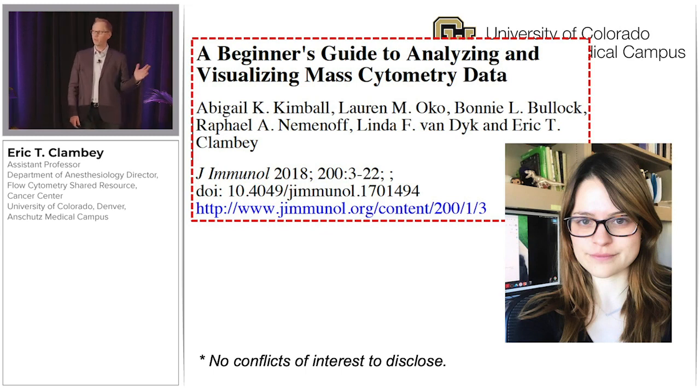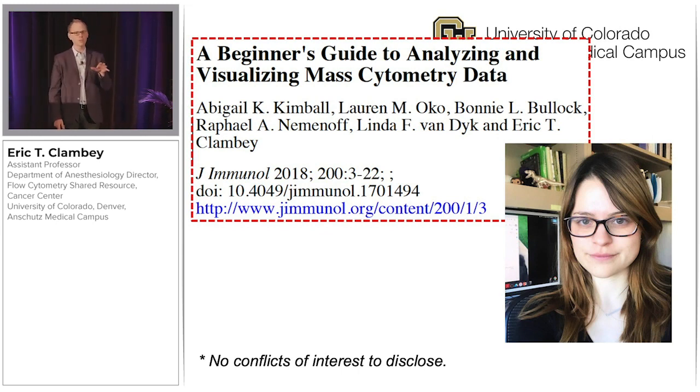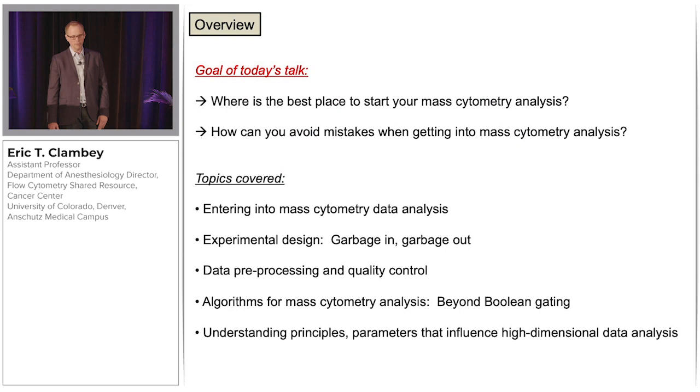We were incredibly comfortable with high dimensional flow, and I was surprised at the gap in trying to transition from high dimensional flow to CyTOF. So in this paper, we described our experiences, provided heavily annotated figures to really help people understand what the different algorithms are showing in terms of data visualization, and also tried to point out areas where you could be misled.